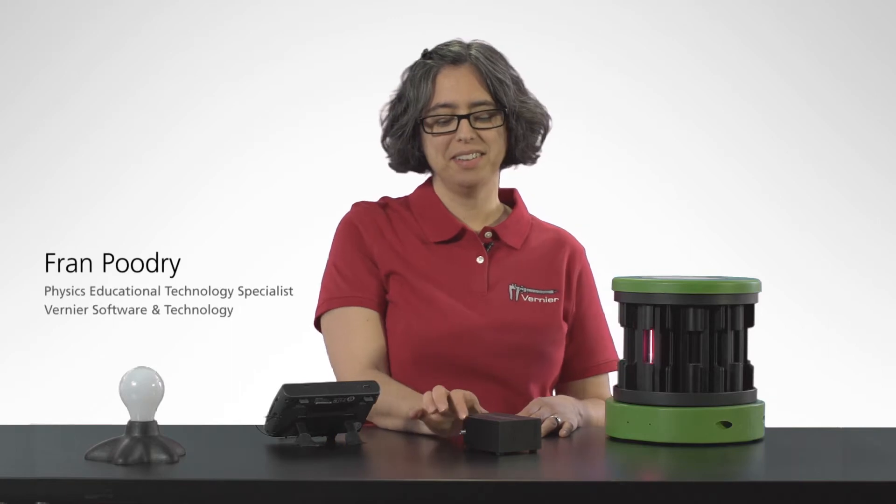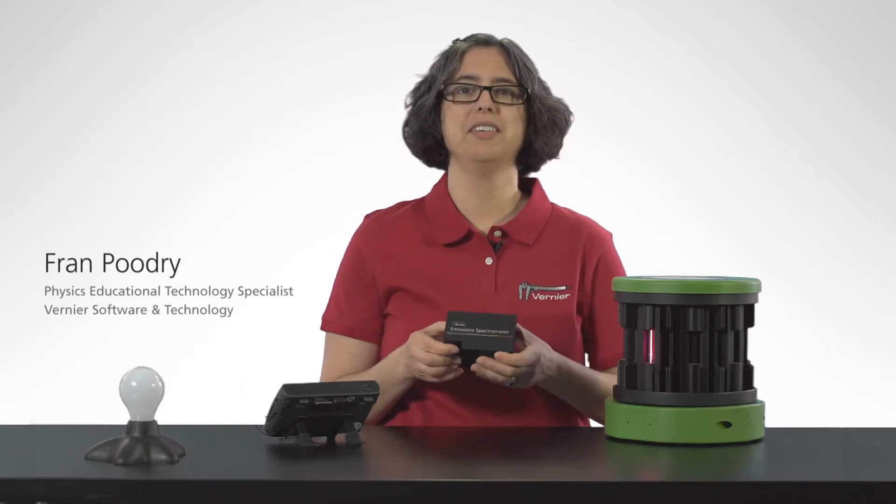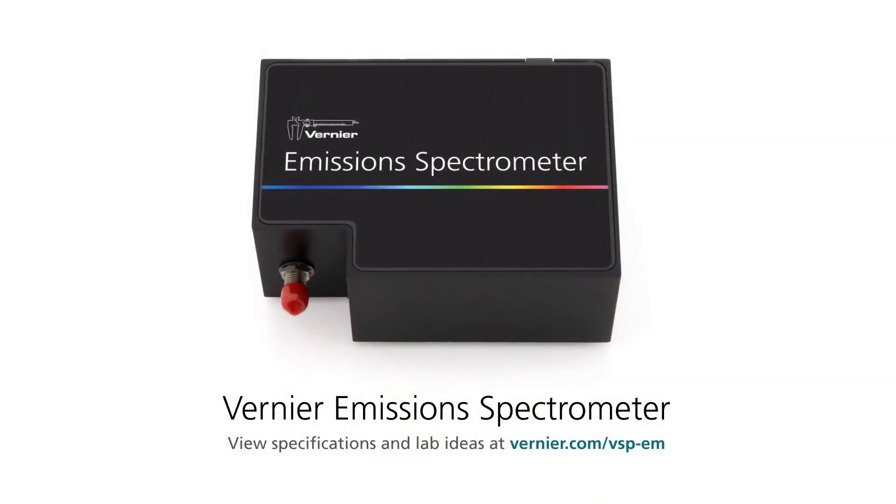Hi, I'm Fran, and this is the Vernier Emission Spectrometer. It uses a high-resolution linear CCD to capture light passing through a diffraction grating.